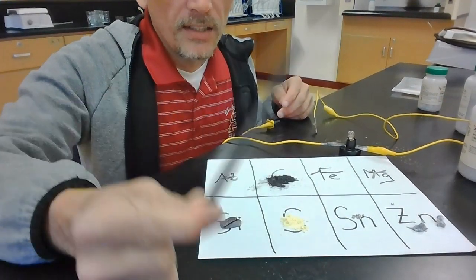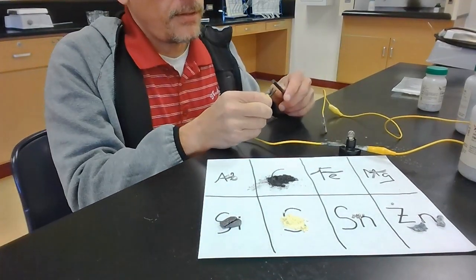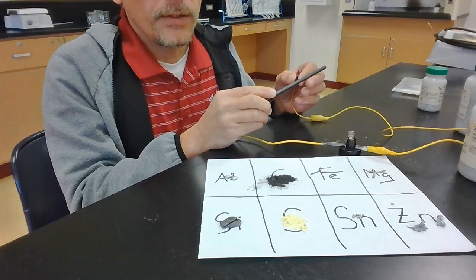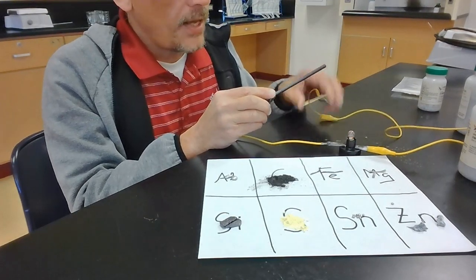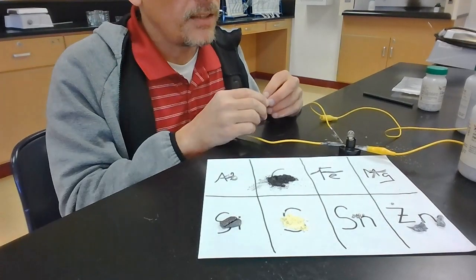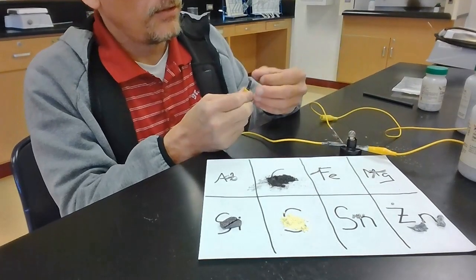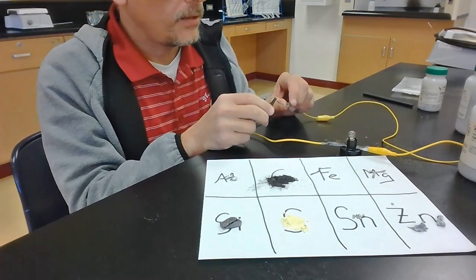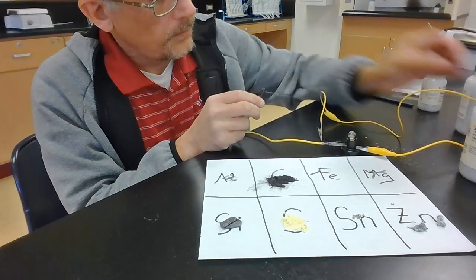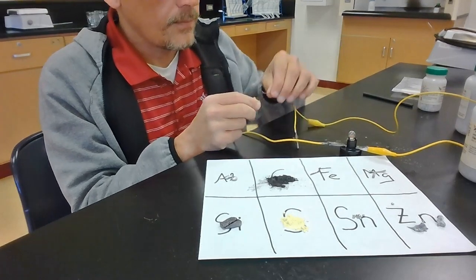So now I've got this carbon rod here. It's a stick and it's made out of carbon. So let's test this, because carbon should conduct electricity. So there you go, it lights up. I have a feeling that's not working for us there because it's a powder and it's probably just not conducting the electricity well because it's a powder. Alright, let's try the iron. Piece of iron. Put some iron here and see if that conducts electricity. Yep, there we go. Iron conducts electricity.